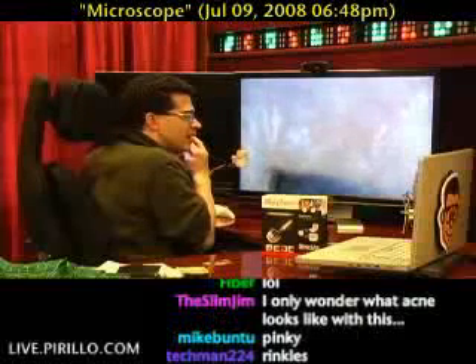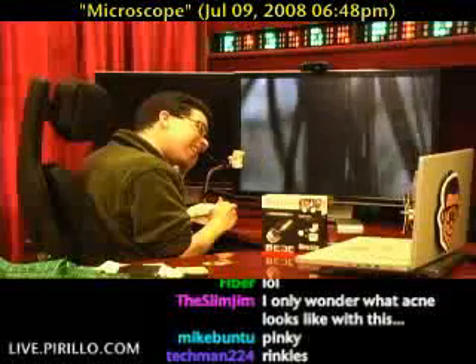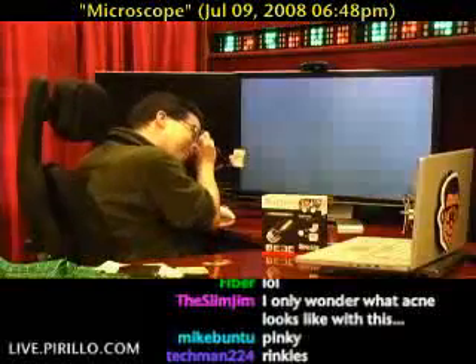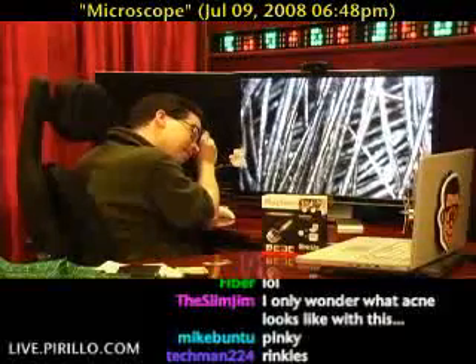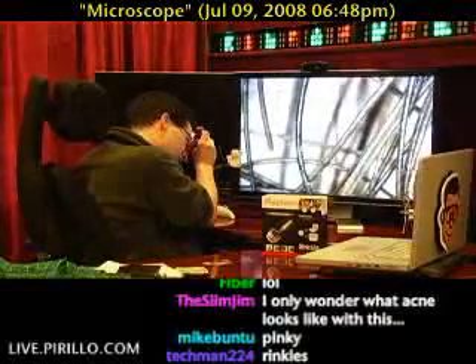Let's go to my hair up on top of my head. Got to zoom it out a bit. Look at that — last time you saw a forest like that, it was probably Return of the Jedi with some Ewoks. It's the Forest of Endor. It's pretty amazing. This is live, this is in real time — 1.3 megapixel image there. Is that a gray hair? Oh, I'm out.